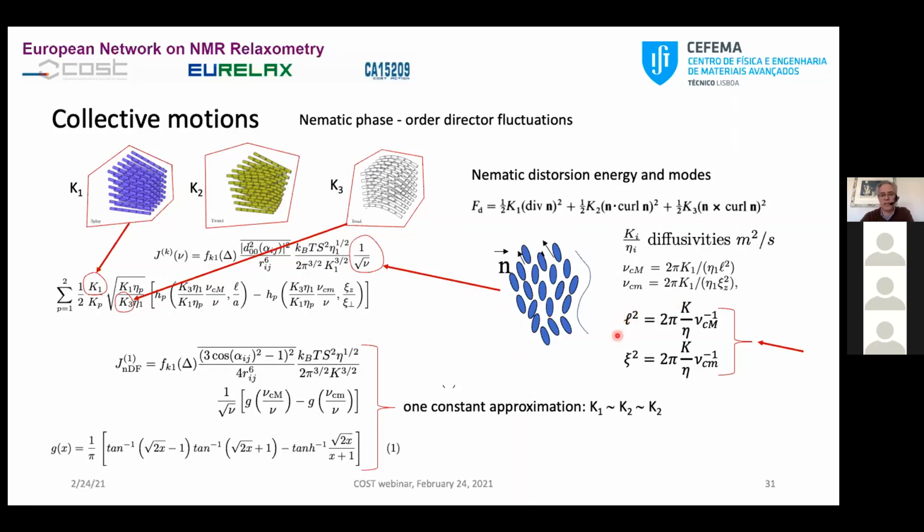One of them is the size of the molecule, and the other could be the size of the sample, the NMR tube holding the sample, but actually it can be slightly smaller than that, and it's called the coherence length. And these numbers depend, in a way, like the mean square jump distance associated with diffusion.